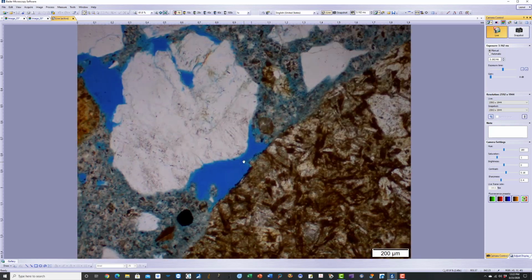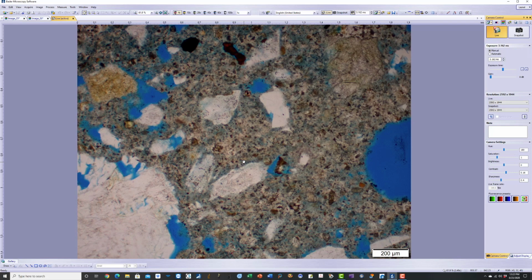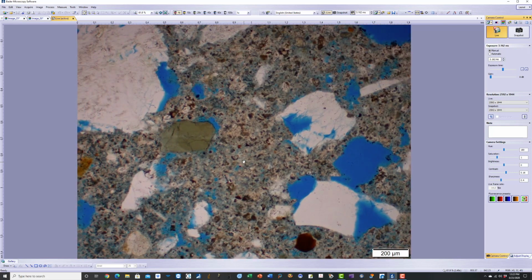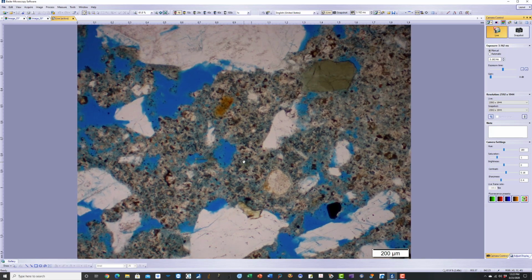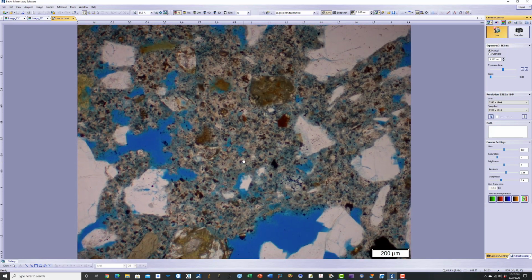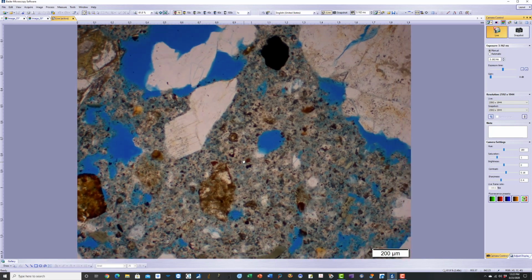The water cement ratio is estimated to be around 0.45 to 0.50. In that range, you have a lot of residual cement particles. Degree of hydration of cement is good. There is no evidence here of any restricted cement hydration in the paste.